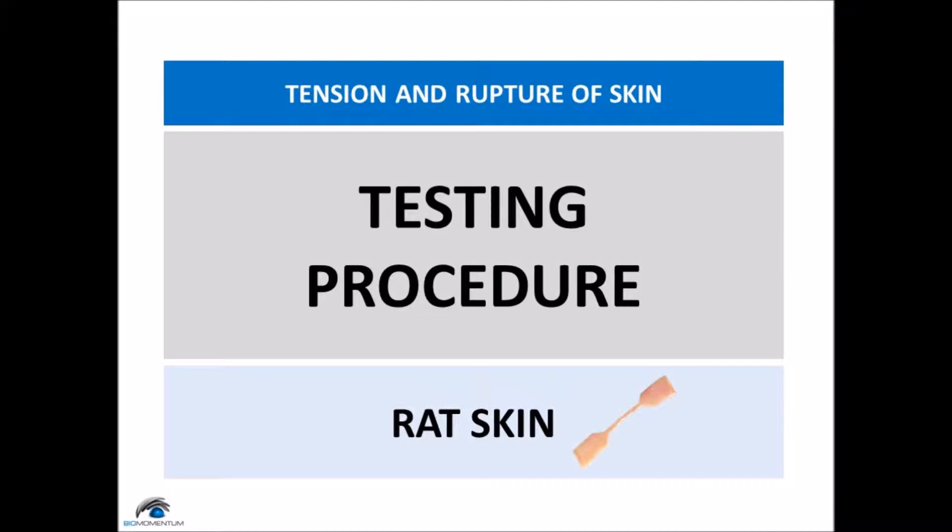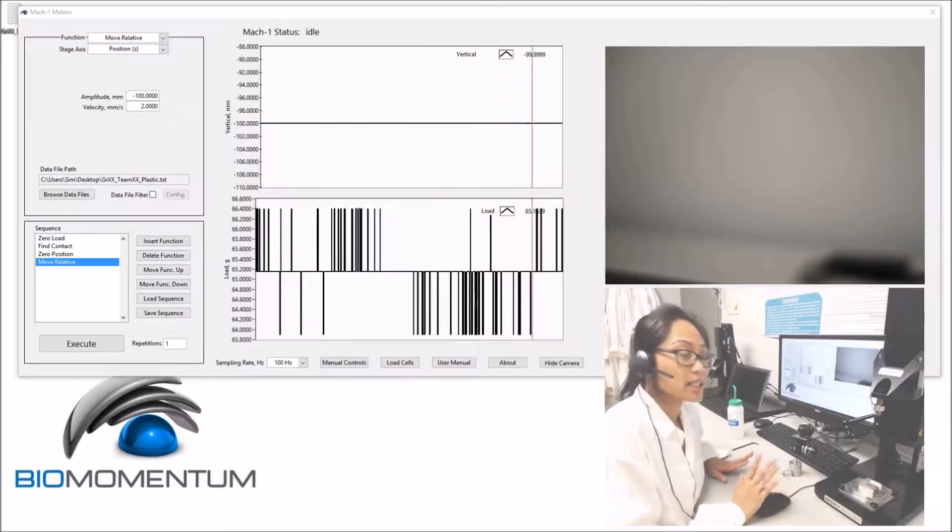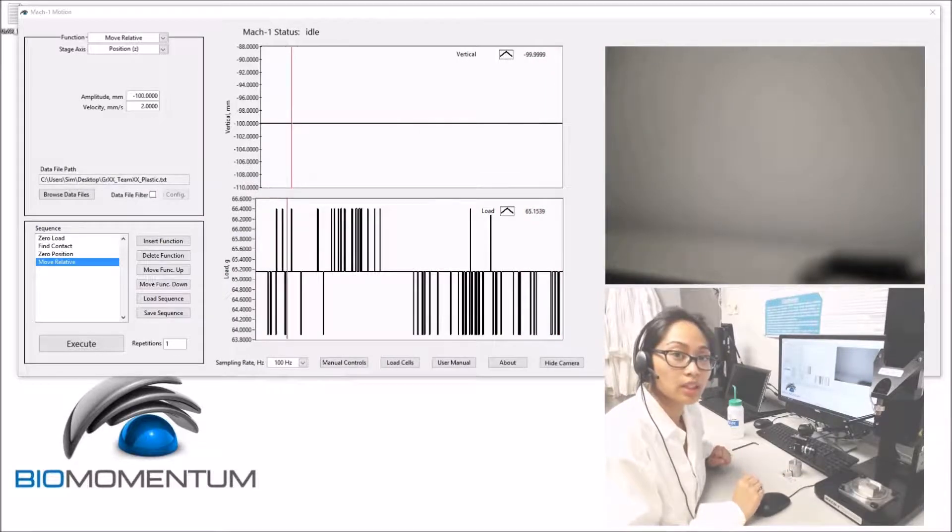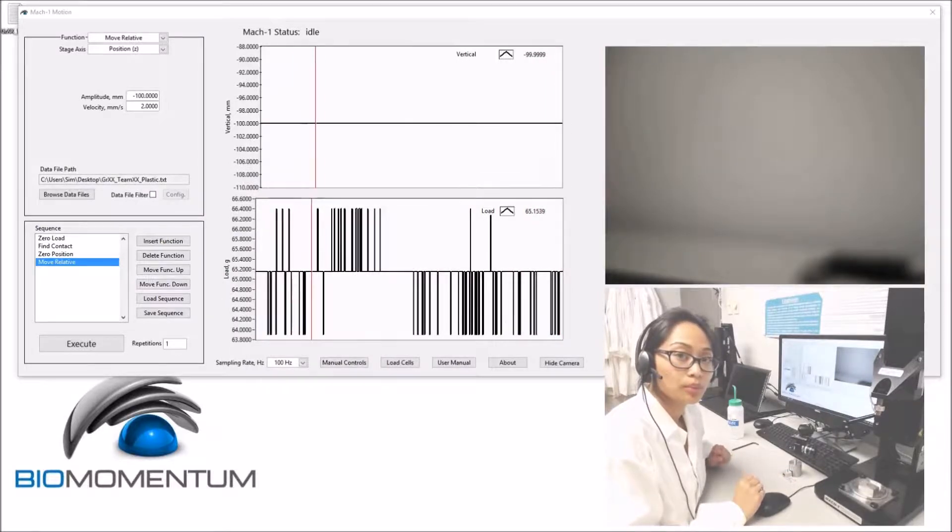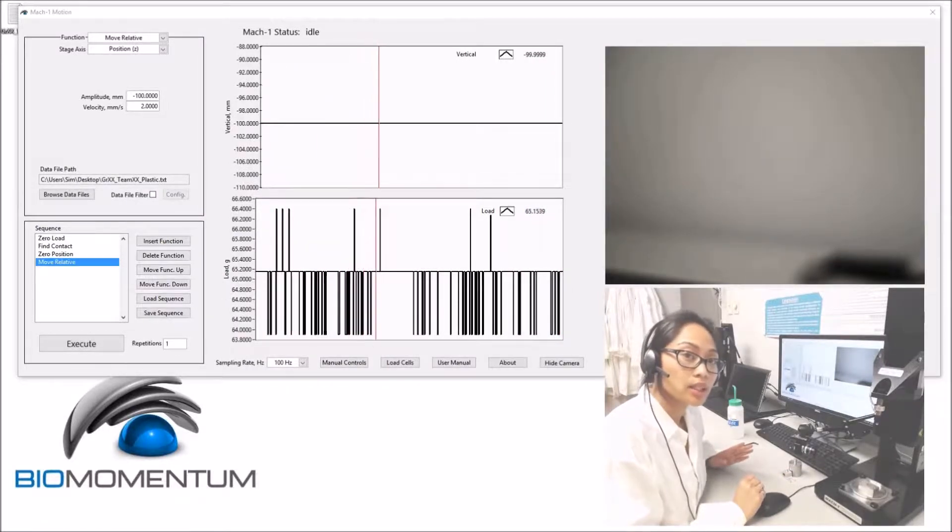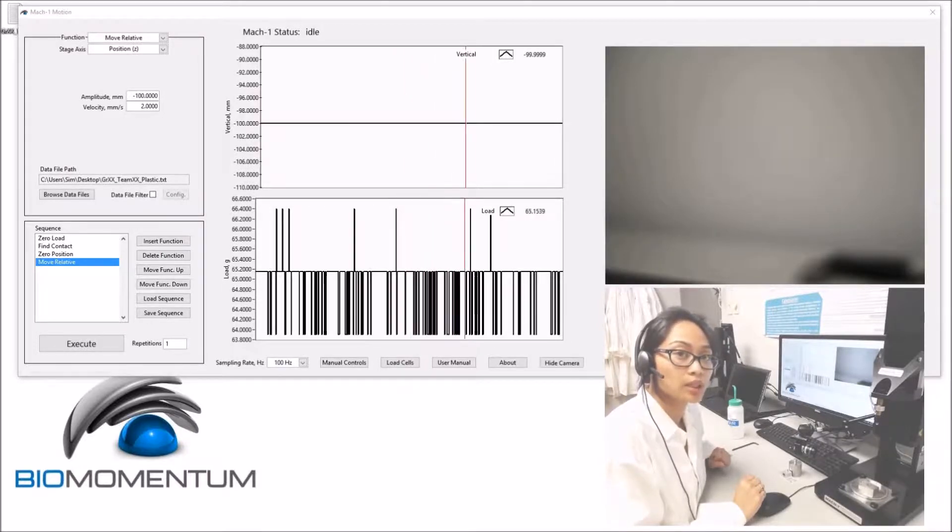And now, the testing procedure for the skin sample. Now that the plastic sample has been removed from the mechanical tester, we can create the following sequence before mounting the skin sample onto the mechanical tester.